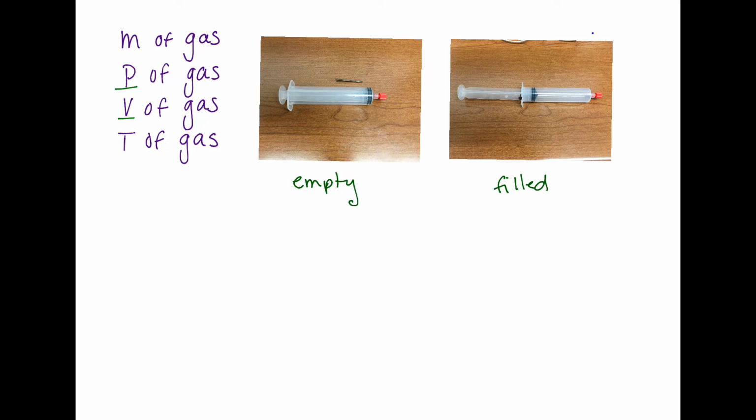Now to find an actual measurement for volume, we could read the syringe and figure out what volume this was. But our lab techs were really nice. And if you focus in on this part of the syringe, you'll see that there's a nail going through right here.